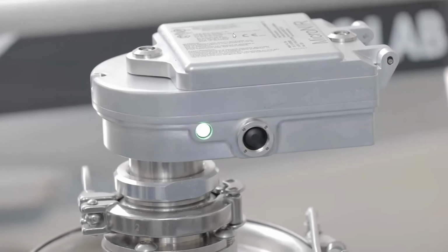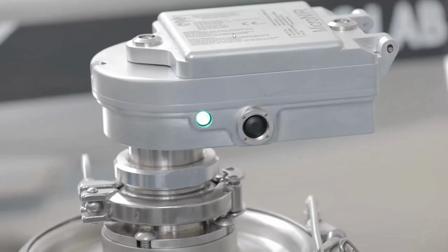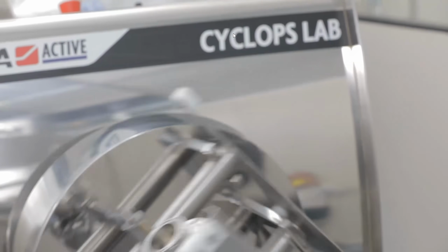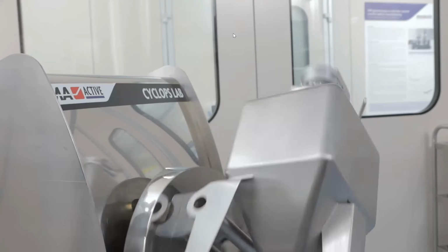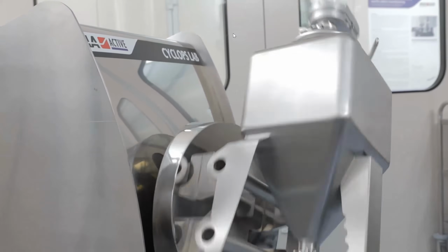MicroNIR has a trigger that starts at 9:15, but by increasing properly the delay time, we can make sure that the acquisition is starting in the proper angle. The trigger settings depend on the bin geometry and also on the rotation speed. Setting properly the trigger is a key point to achieve good spectra.